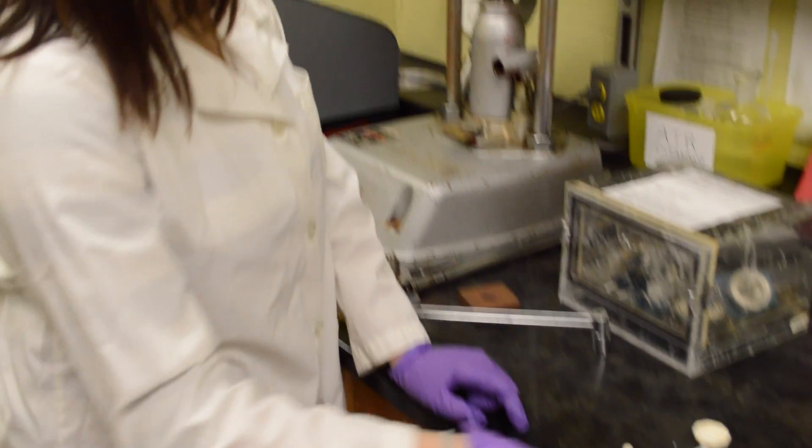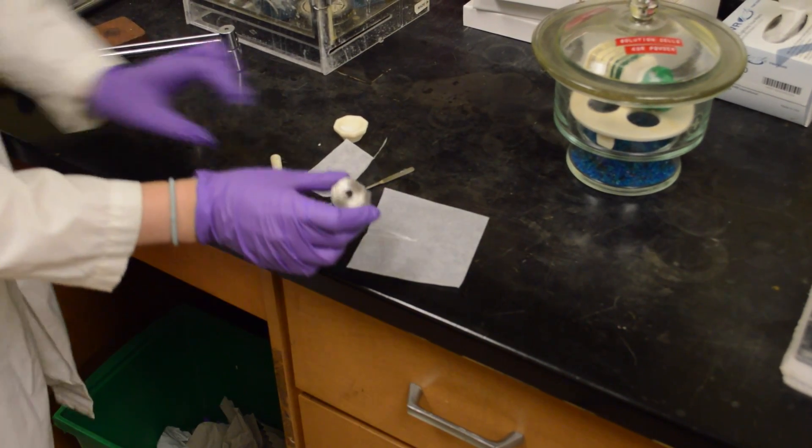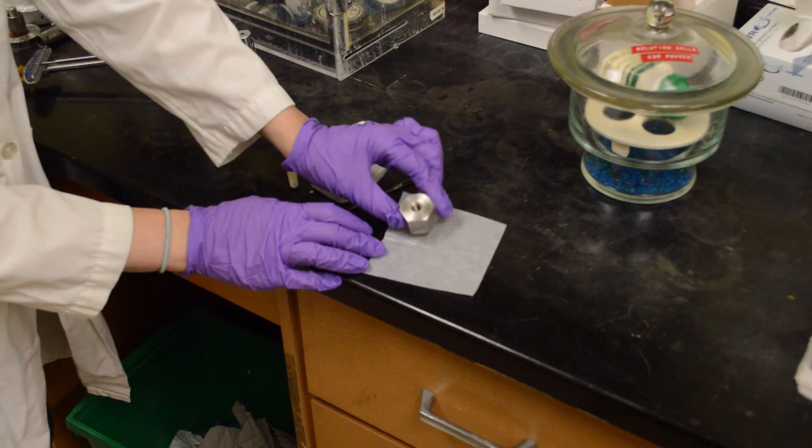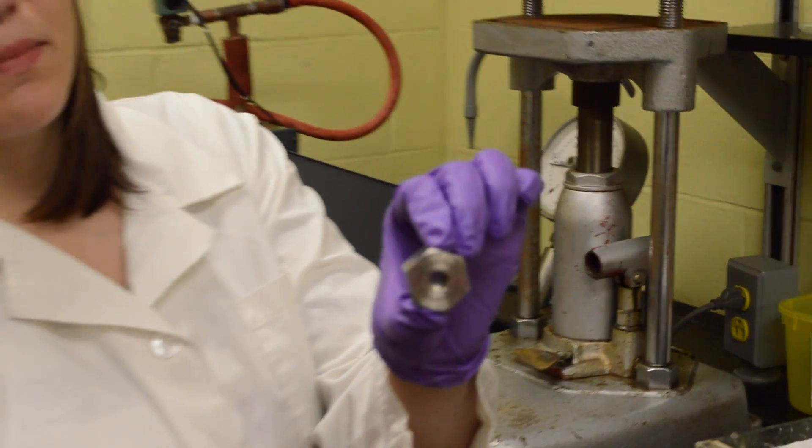Then you want to tap out any excess KBR. Just give it a little light tap on both sides. As you can see, there's a little plate formed on the inside of the barrel.